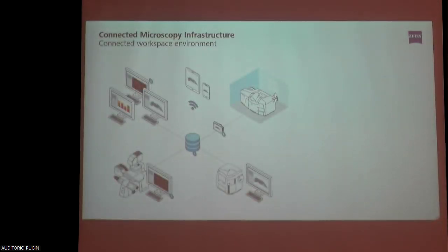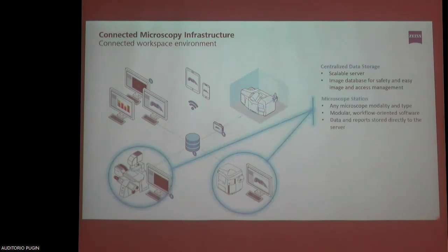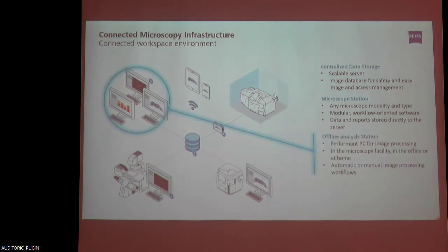Okay, and of course connected microscopy could mean that you have everything connected in your facilities. So all the different systems are connected to a centralized data storage server, then the microscope workstations where multiple different people can work on different systems remotely or live, directly on site of the system. You have offline workstations to do the image analysis, either live or also remotely accessible.